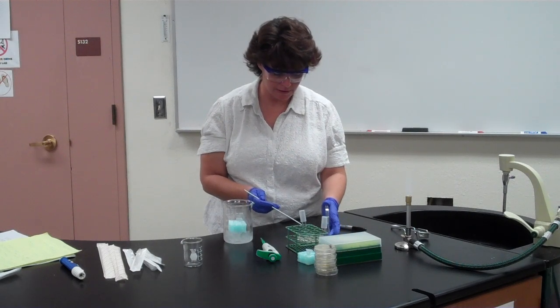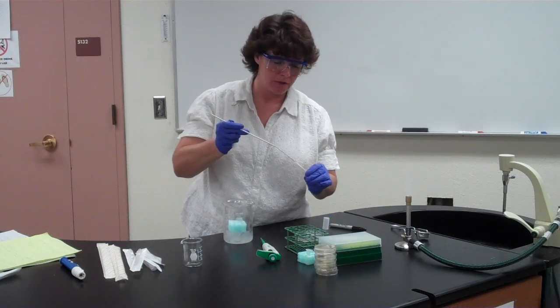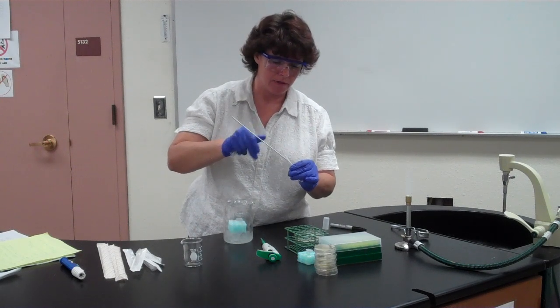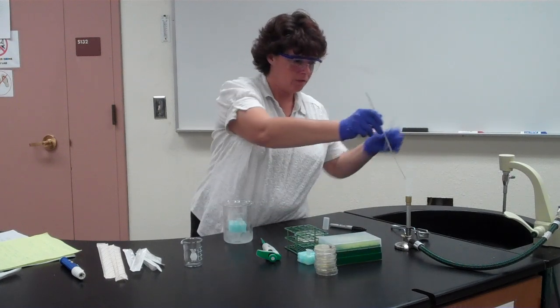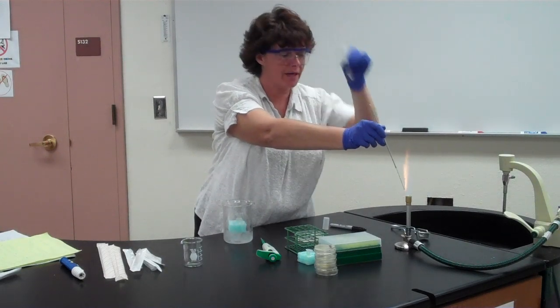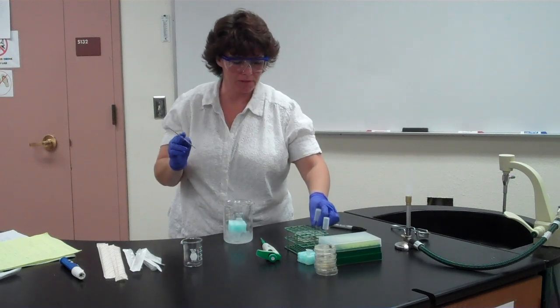Another good sized colony. Now remember, don't gouge the agar. If you gouge the agar, you're going to end up with agar in here, and it will mess up the results. So you want to break it off on there. Make sure it comes off. And you want to have a milky solution. So I don't know if you can tell, but there's definitely a lot of bacteria in there. If it still looks clear, you haven't added enough, so you'll need to put more.